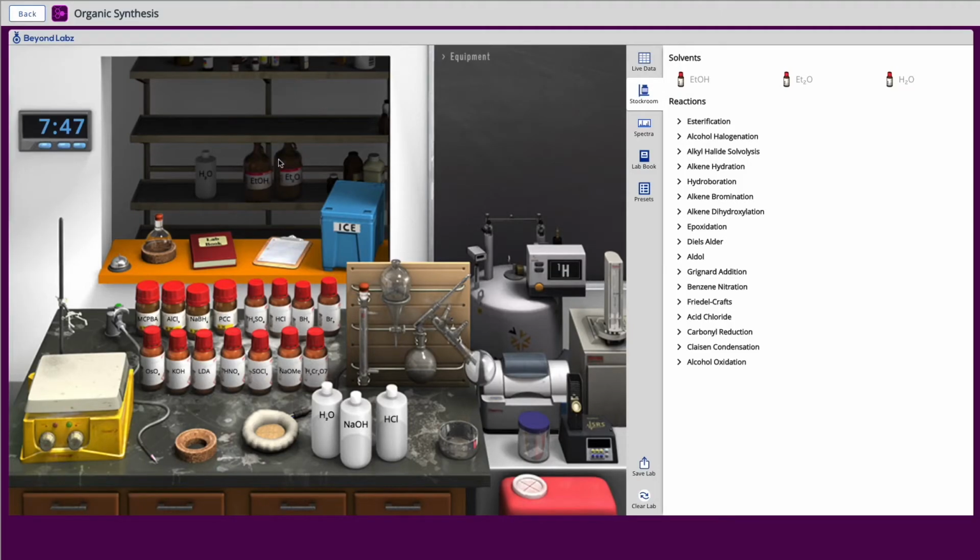Welcome to the Organic Synthesis introductory video. This video is designed just to give you an overview of what can be done in the Organic Synthesis lab. If you would like more details on what's provided here, please check out our playlist on Vimeo.